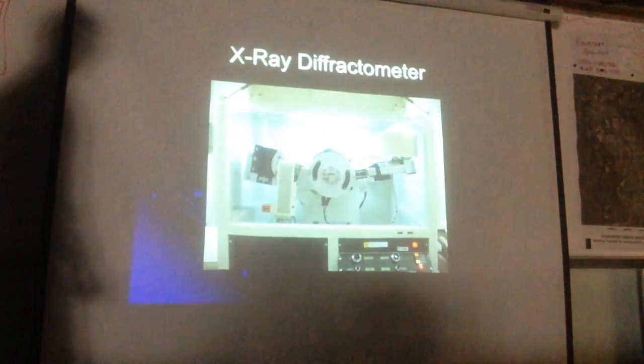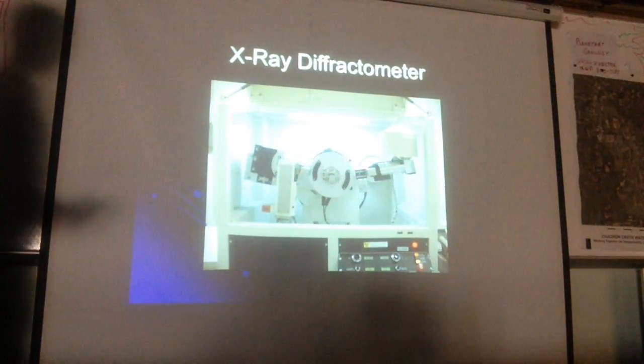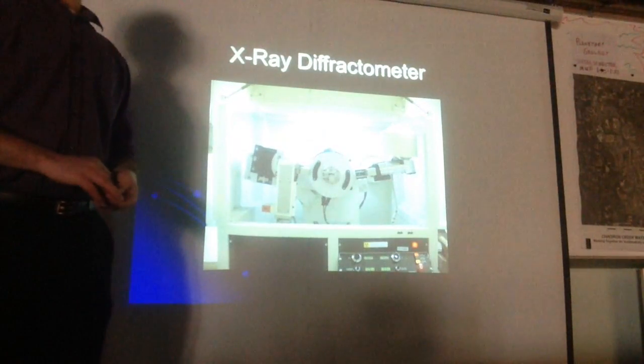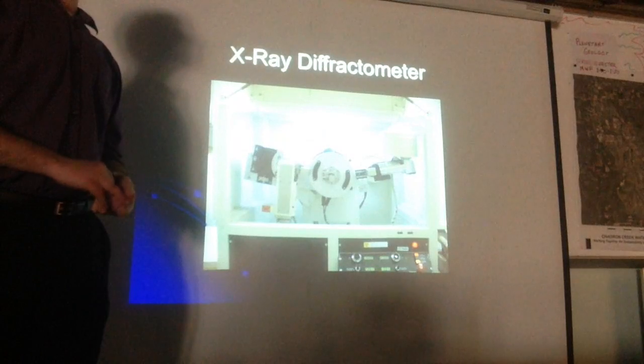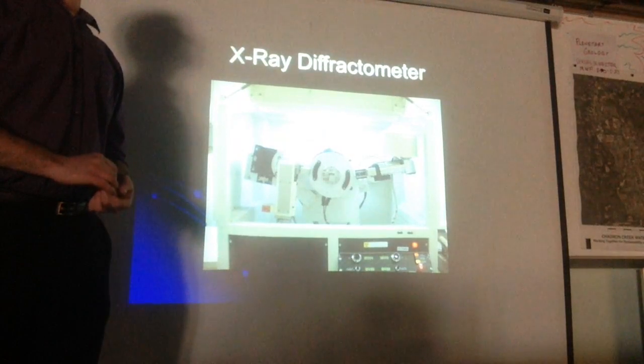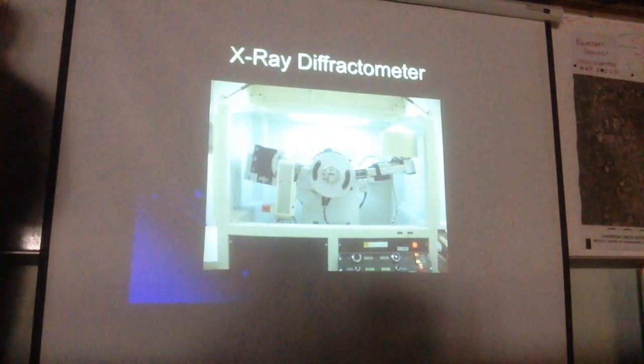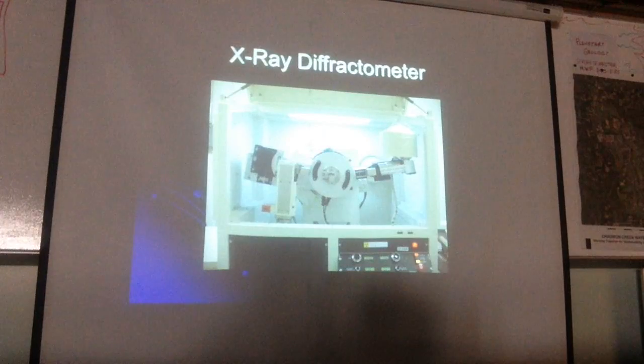And you can also adjust the scan speed. Usually I used to set mine to, if I wanted a really good scan, like 0.5 degrees per minute.